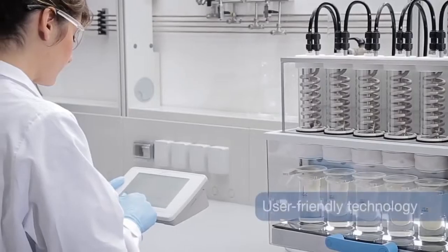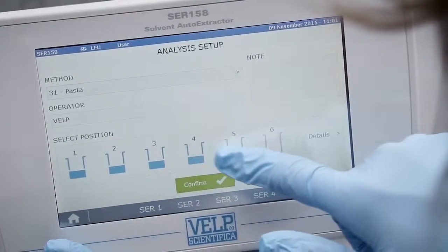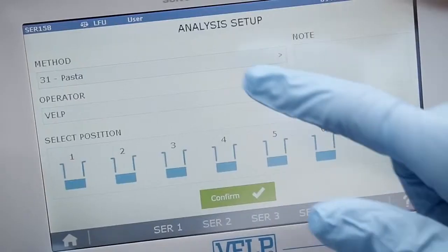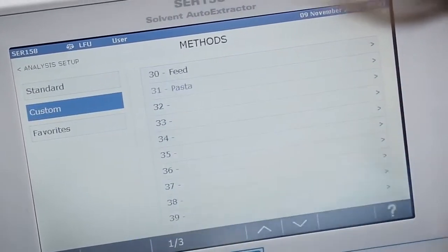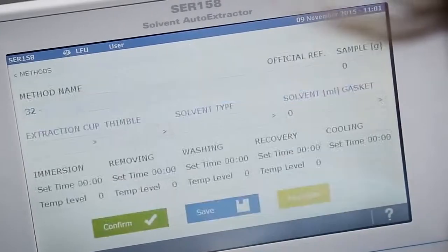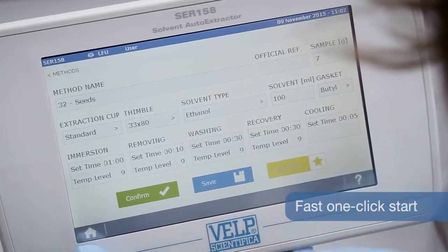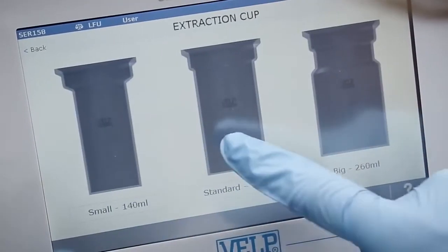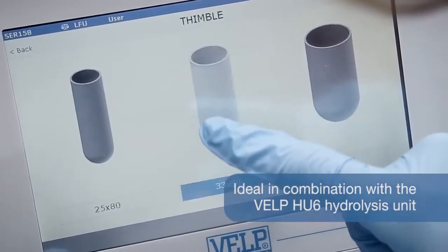From the choice of materials to the user interface, the system is designed to give the operator full and precise control of the whole extraction process. Choose from more than 20 standard methods, create your own and save your favourites for a fast one-click start. Choose from different extraction cups and sized thimbles to optimise consumption and accuracy.